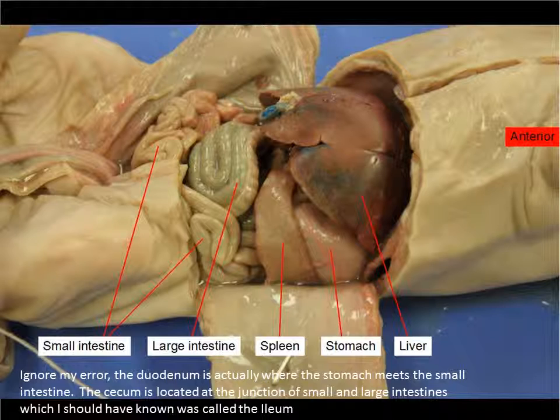Sorry, I lost track of something. But you're going to have to lift up the liver to get to the pancreas and the bile duct. Not the bile duct, but rather the gallbladder. That should be a deflated sac. Some of these are extremely non-self-evident, so again, look around to your peers for better examples.